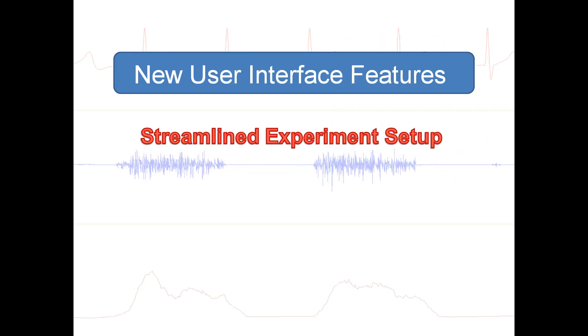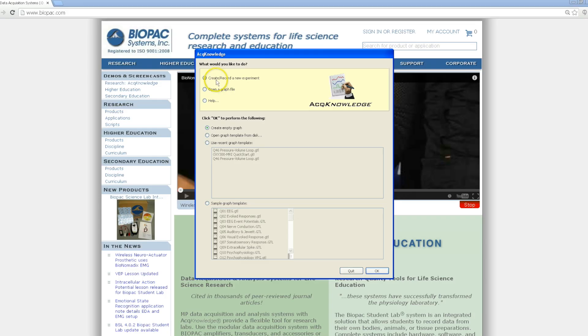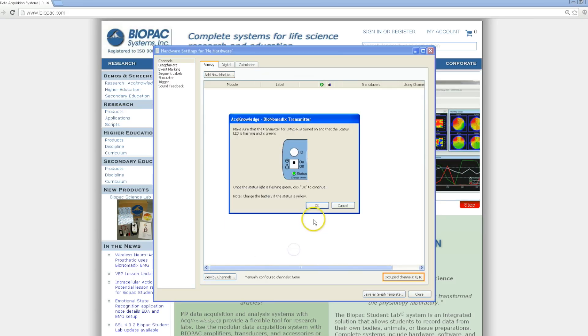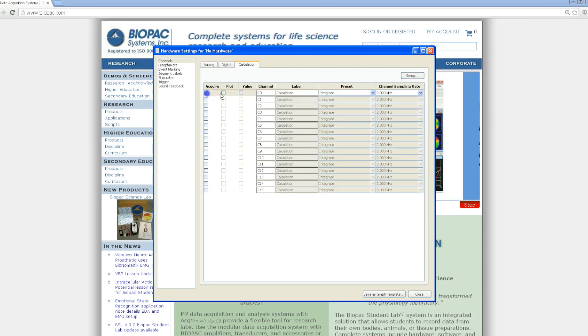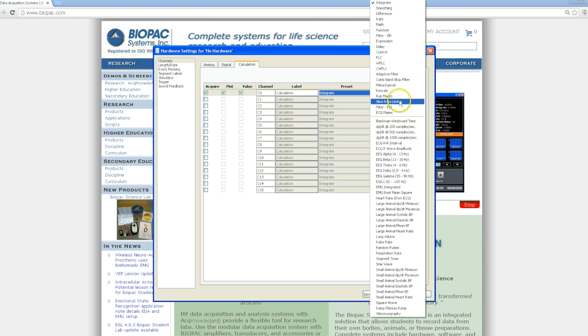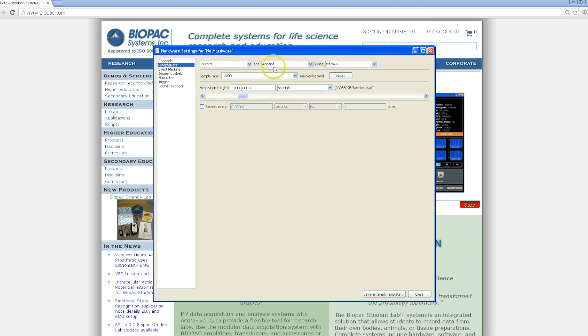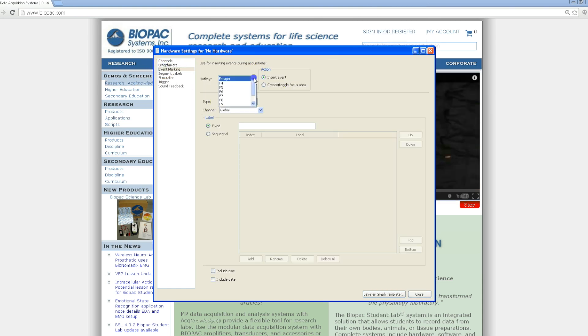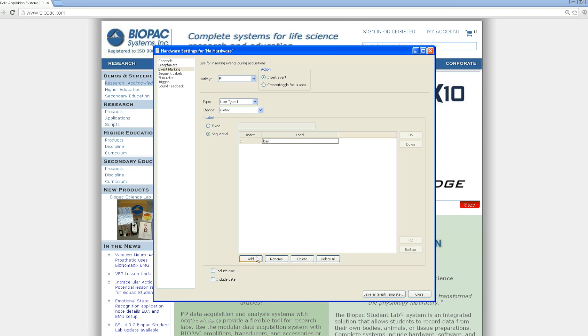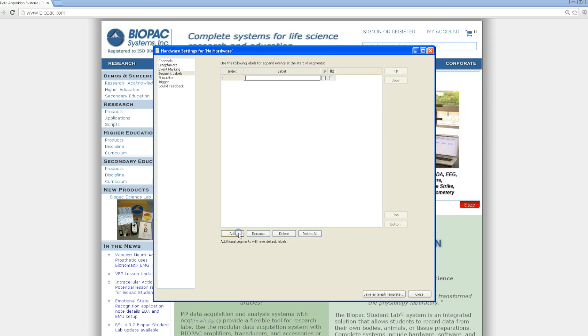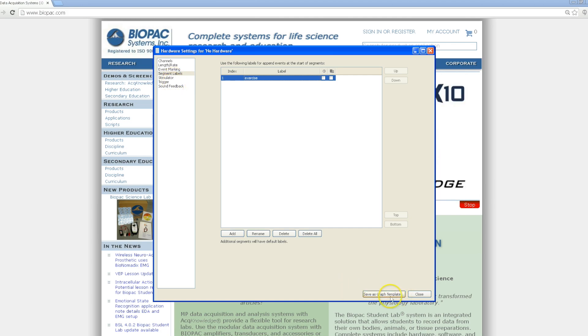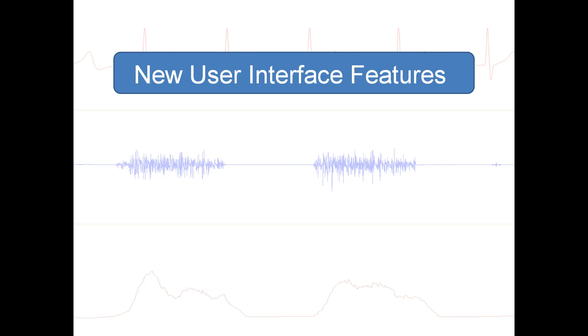Streamlined experiment setup allows you to configure your analog, calculation, and other channels, as well as acquisition settings, event markers, segment labels, and advanced parameters all from one streamlined dialog window.